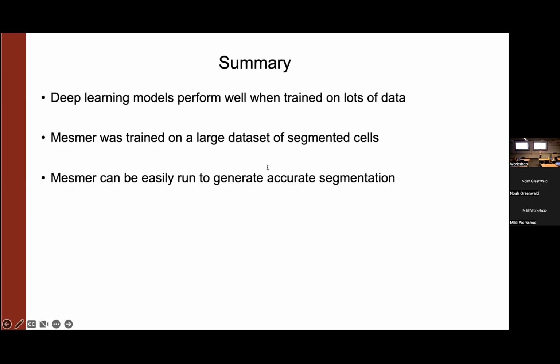Whatever the answer is, it's a problem, and you don't want cell objects to come from necrosis, because then you're really going to have what Tyler likes to call party clusters of cells where they just express everything. So the approach we've taken is manually identifying where the necrosis is in the image and then masking out that part of the image, so that we have a flag saying we could go back and look at it if we want, but there's something in the cell table that says, by the way, this actually came from a necrotic region, so that you don't get confused.